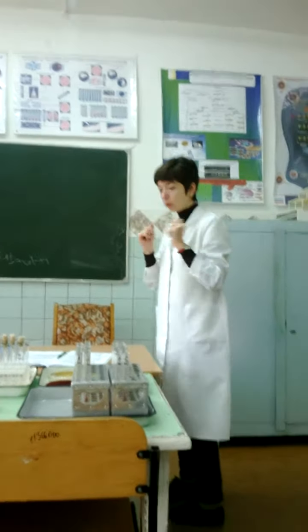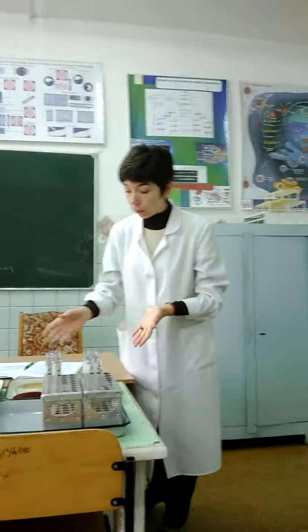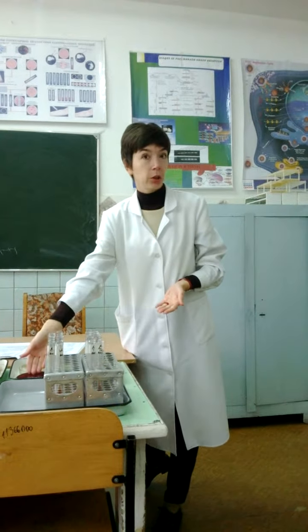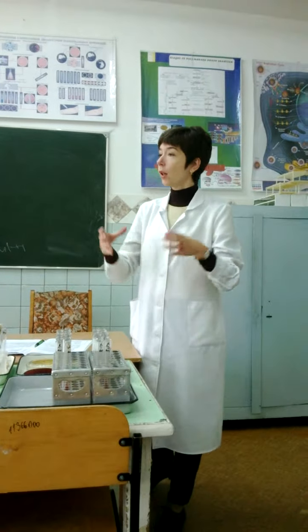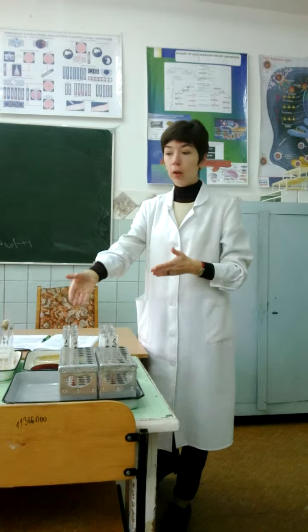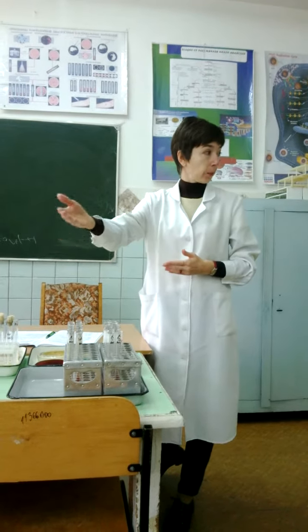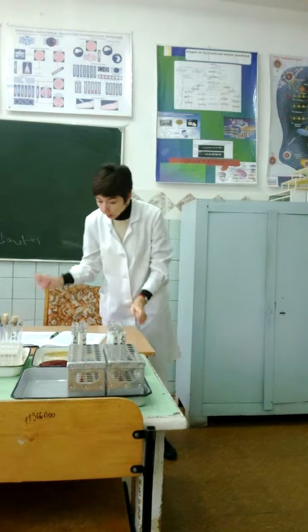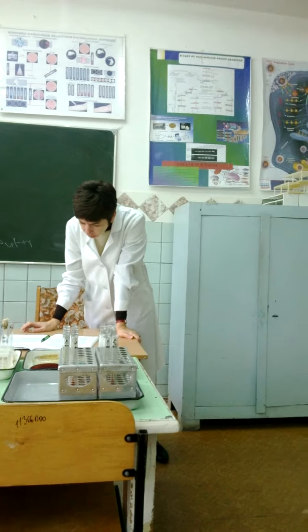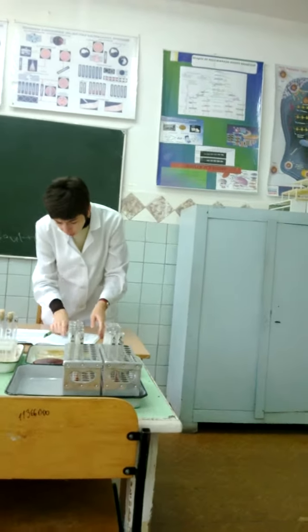It's a test also for Staphylococcus. It may be combined. You may be given, on modules, one petri dish and another with this test, and asked what this is. You may say that it's a test for isolation of Staphylococcus and a biochemical test for identification. Is that clear?